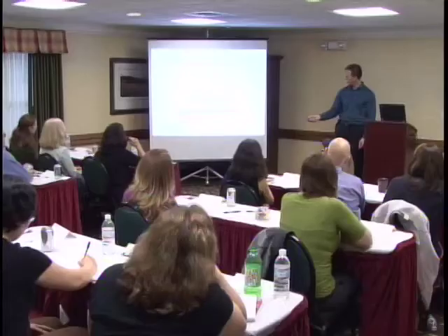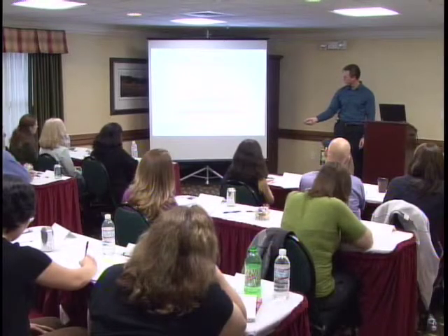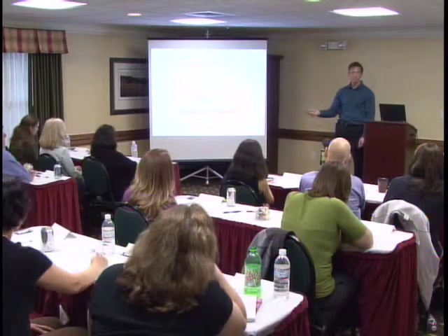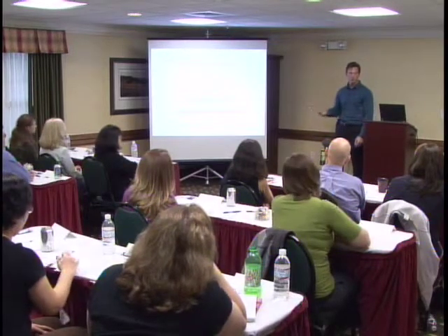So we can put an amplicon with a base composition and coordinates onto a map, and that map is the control region of the mitochondrion. So we have 3 within this reaction. That's the beginning of a profile.